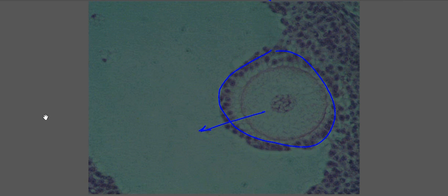I don't think it's mentioned in your lab manual. All right, so this is the oocyte. Okay. In your lecture, you guys are going to need to know all the parts of that oocyte, right? So what is this thing around it and so on. But for the lab, this is what pretty much I need you to know, right?